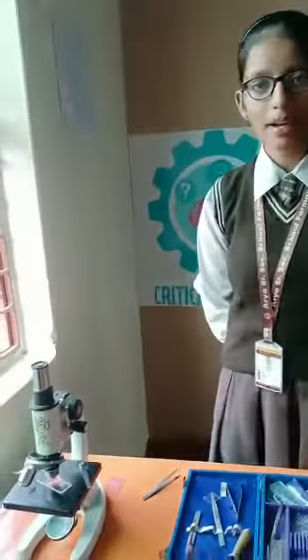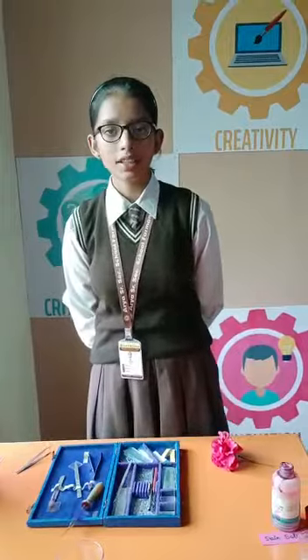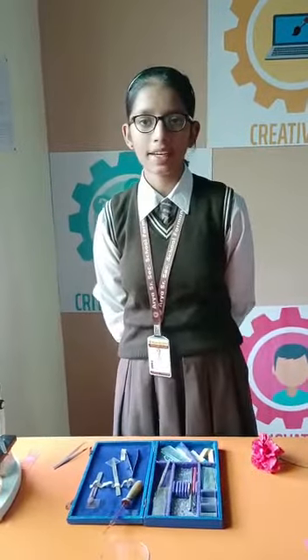We can observe the pollen grains attached to the stigma in yellow color. Pollen grains are the male gametes and are microscopic and circular in shape. This is all about this activity. Thank you.